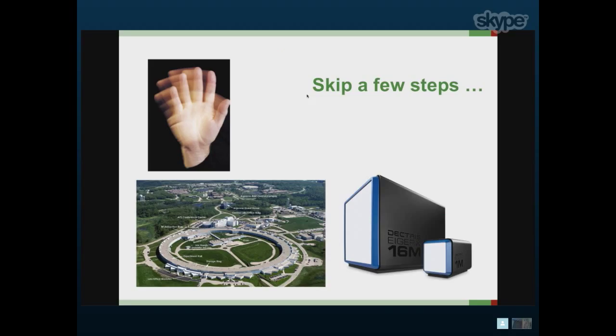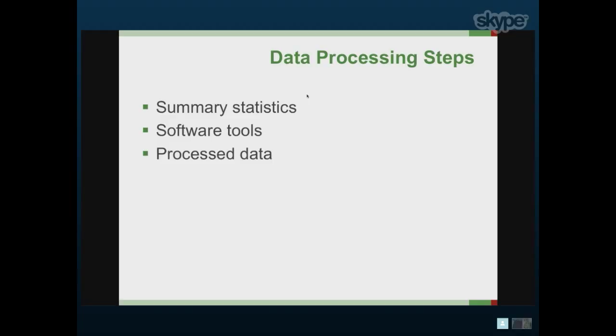And then I think everyone would agree that there are a few steps that are left out of the PDB's pipeline, which is largely the subject of this workshop, which is the raw image data that is contributed to the PDB after a significant amount of processing.